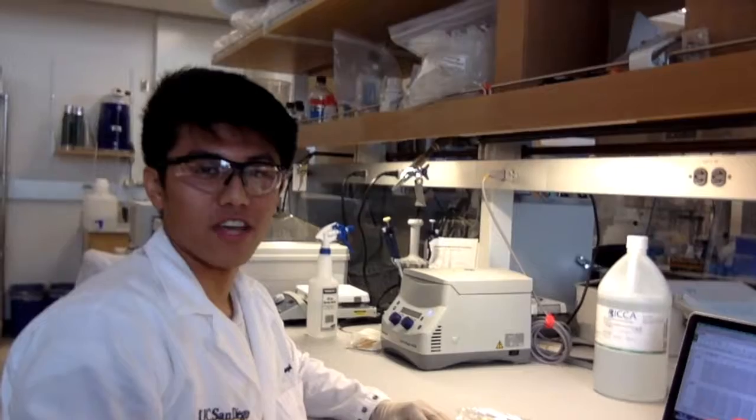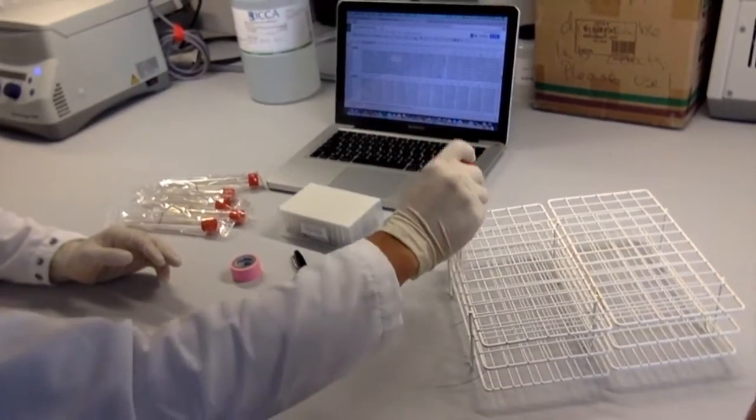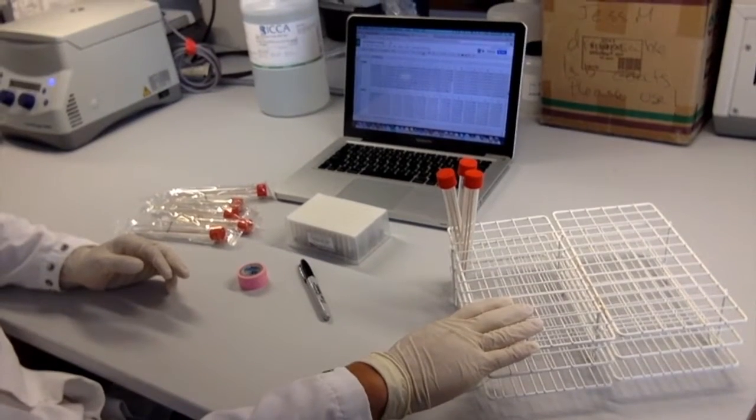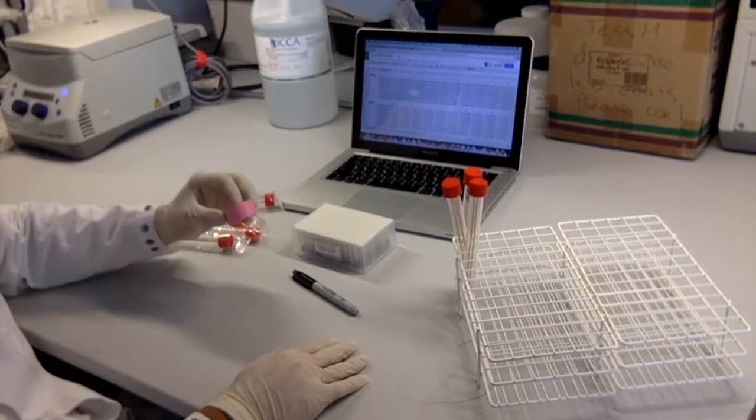Step 4: Gather your utensils — our swabs, our mapping rack, parasoil plate, a sharpie, and some tape.